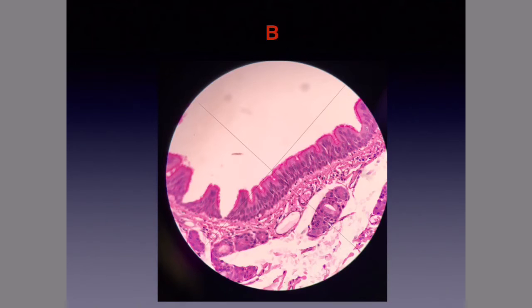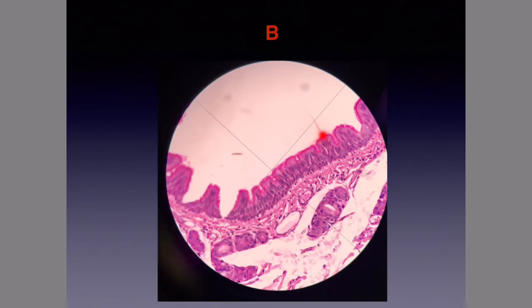Slide B. If you take a look at slide B, you can see that this appears to be columnar tissue, and then you have these nuclei at different levels that gives a false appearance of being stratified, and then you can see some ciliated pattern here on the apical surface of this tissue, so this would make this particular tissue pseudostratified columnar epithelial tissue.